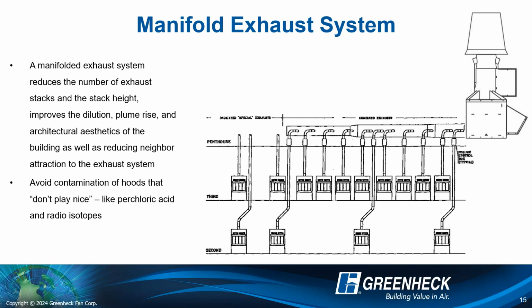So you as engineers, as you're designing, you're probably doing more and more of these, where you take fume hoods that are doing the same type of reaction, the same type of research. So it's all basically the same stuff. We're pouring it into one common duct now. And instead of 50 little fans, we're using 2 or 3 bigger fans that can take all of this air from these hoods and combine it and give you a much, much higher plume rise. But you have less fans to maintain, less roof penetrations, all good stuff, which can be an advantage to the operation of your system. And we're going to talk about how this saves energy here in a few minutes as well.